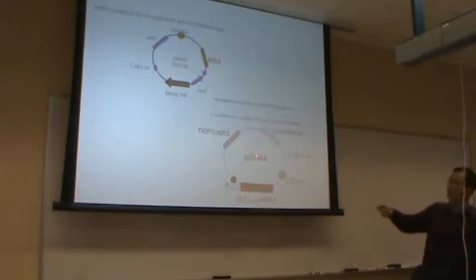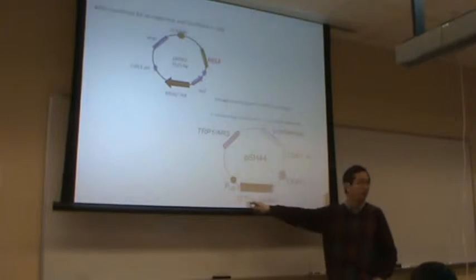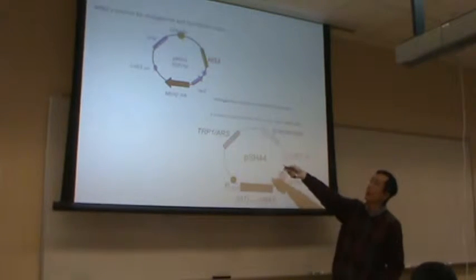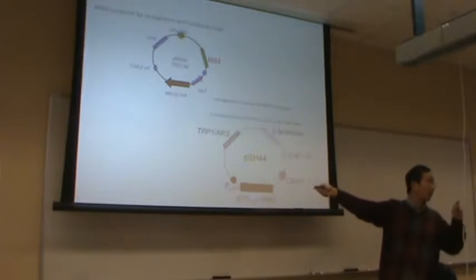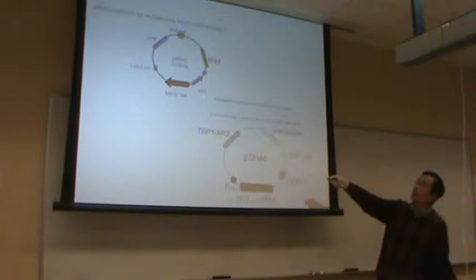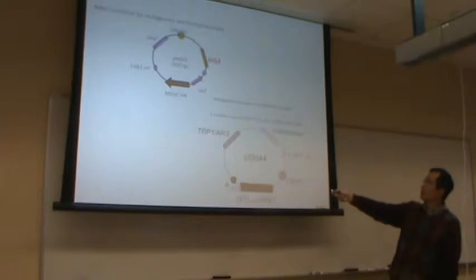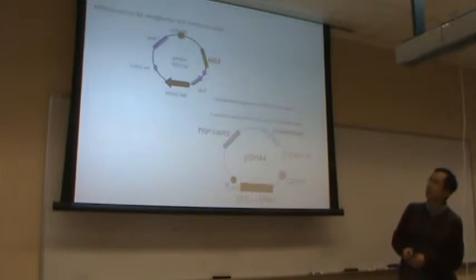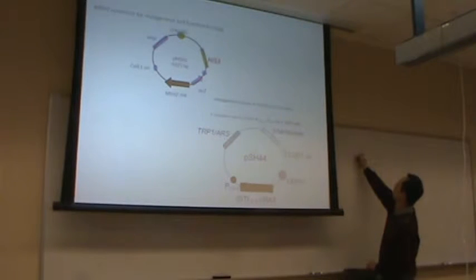That's our reporter plasmid. The reporter plasmid has a URA3 with the microsatellite repeat in front of it. And that's the pMSH2 plasmid we transformed last week. This one has a histidine marker. This one has the tryptophan marker. So for the transformation, we used a media which is minus tryptophan.